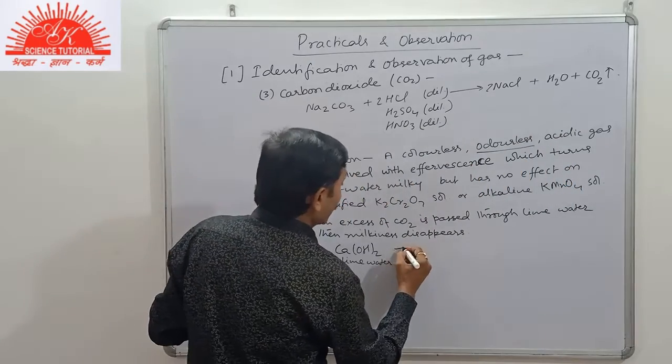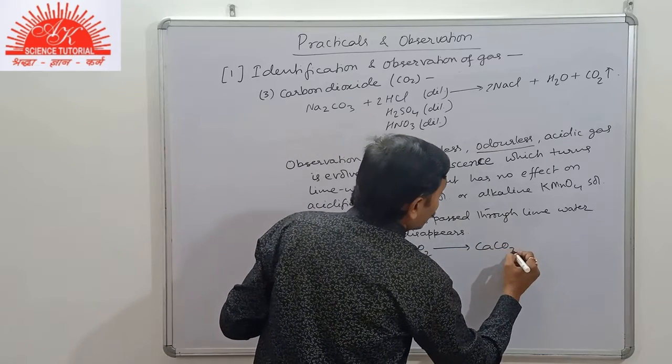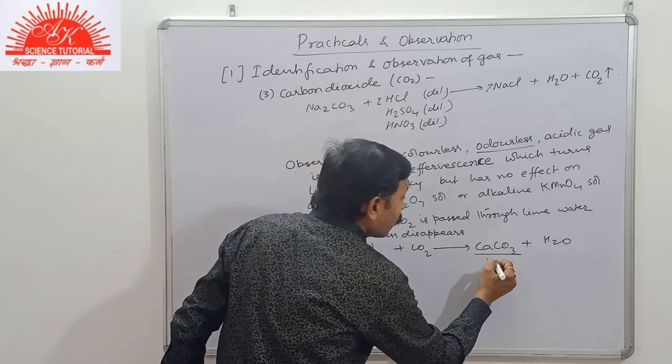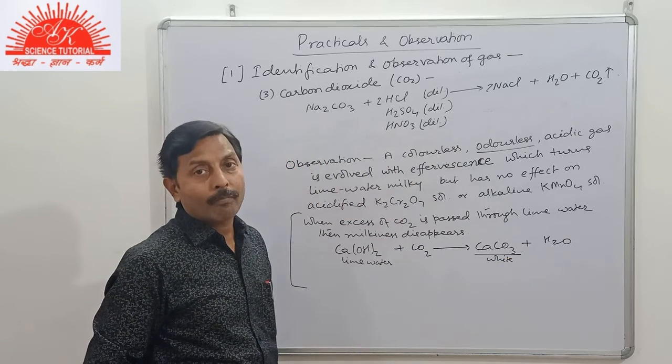So when CO2 is passed through lime water, it forms calcium carbonate plus H2O. This is white, so it turns lime water milky.